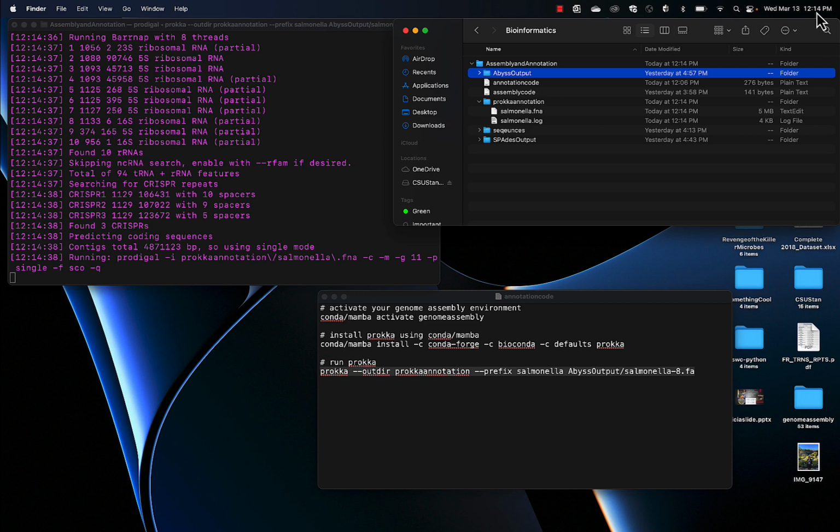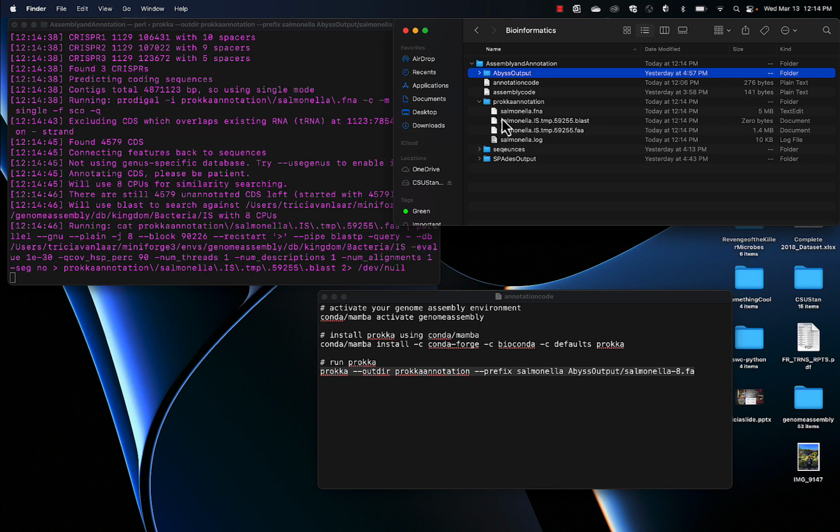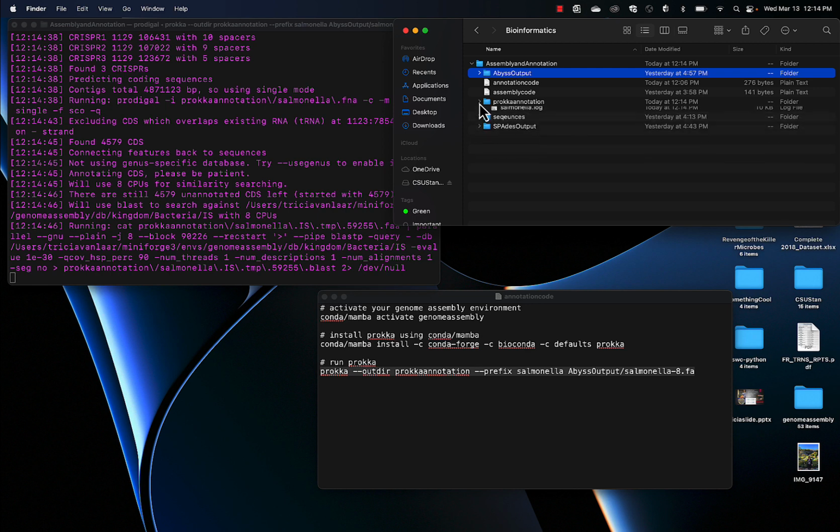I started it, it's 12:14. So I'm going to step away for a little while, and I will come back and see when it's done. I'm going to go ahead and pause the video, and then I'll start it again when we're done.